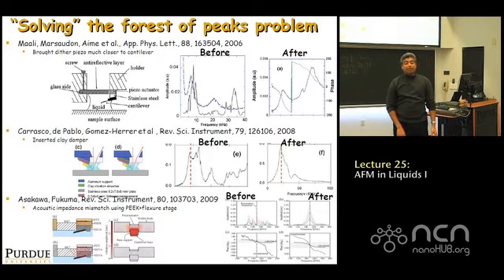If you look at the Lorentz force actuation, we talked about these direct mechanisms before. So for example, there's another mechanism, which is the Lorentz force mechanism, where, let's say you've got a triangular cantilever, you pass an alternating current through that and have a permanent magnet sitting under it. You get Lorentz forces.